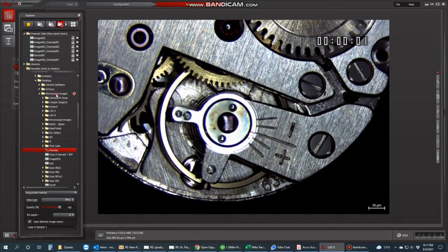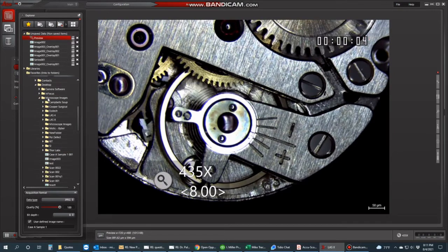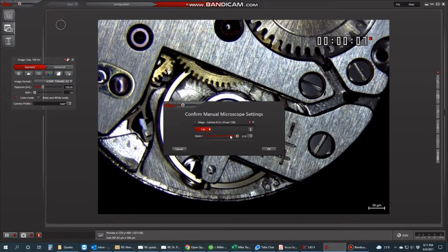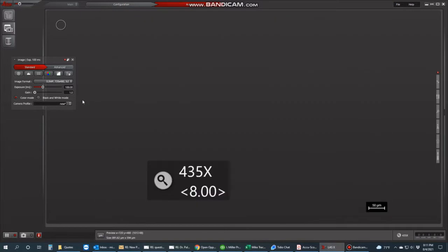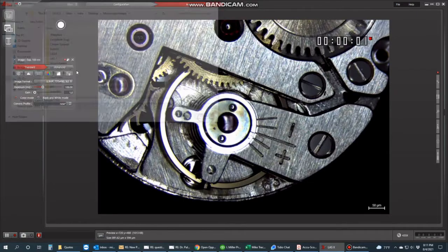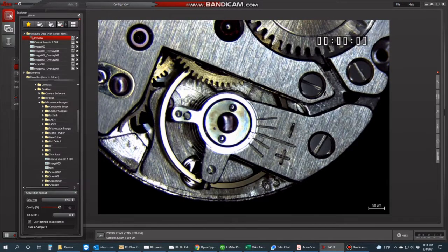So again, it may be beneficial to have this simply prompt you to pick a name each time by unchecking my acquisition folder. And again, now when I click capture, ignore this aspect, it's going to say, okay, now you pick a name and a location, but again, it diverts back to where you last saved the image. Okay. Important, minor but important.